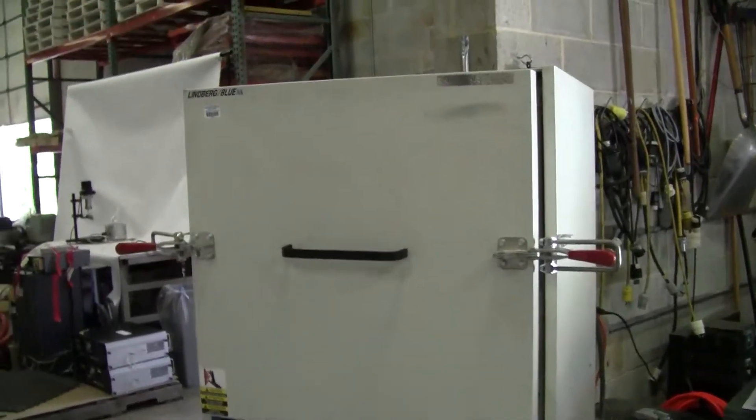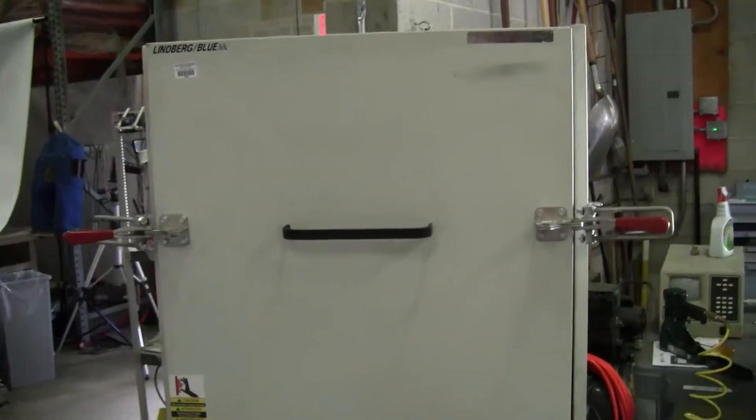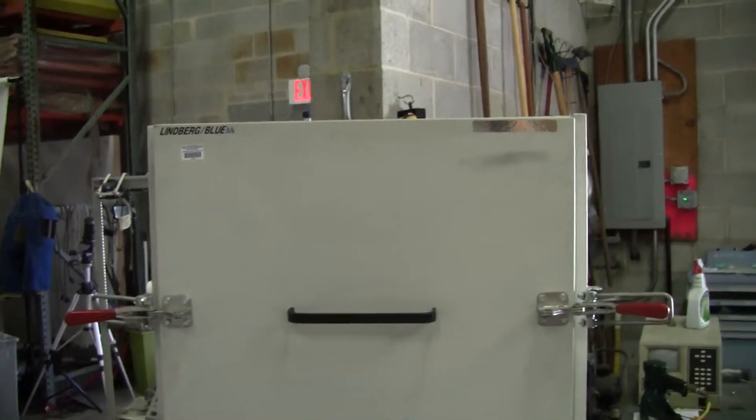Hi, this is Michael Naitow from HitechTrader. Today we're looking at a box furnace. Manufacturer is Lindbergh Blue M.